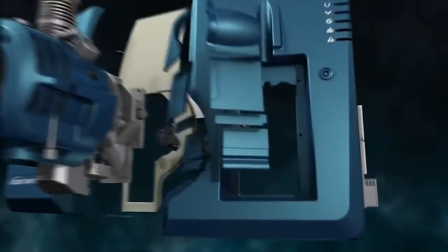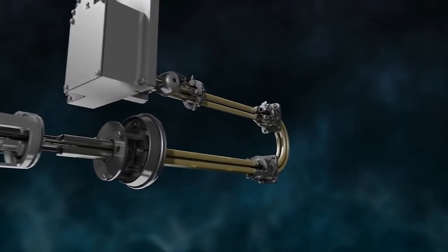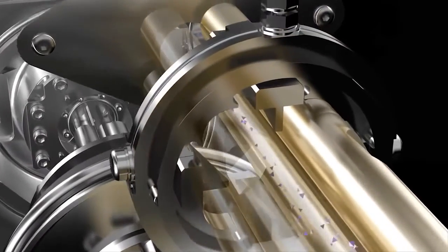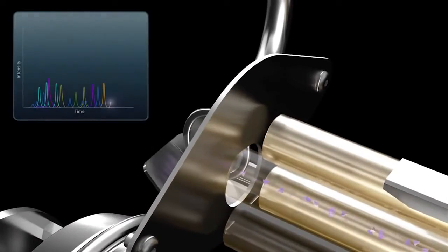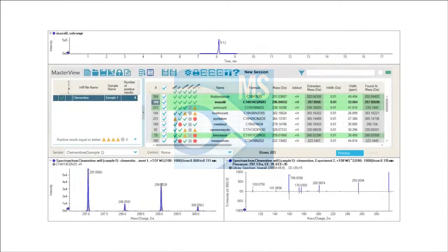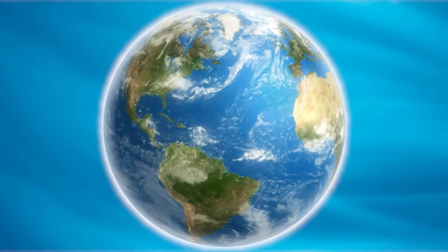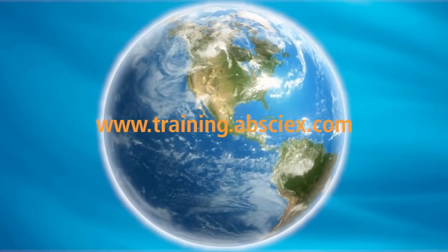A popular example is the triple quadrupole that uses alternating RF and DC voltages to separate ions. Once separated, the ions hit the detector. The detector will amplify the signal and send it to the workstation for converting the information into a mass spectrum. Application-specific software can be running simultaneously so that the data gets reported out to a simplified view that even a novice user can understand.